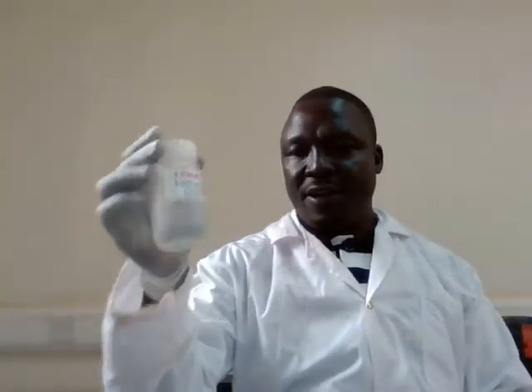Okay? So these petri dishes here are made specifically for use in membrane filtration technique. This is sterilized water you can use for preparation of culture media, all the liquid media.